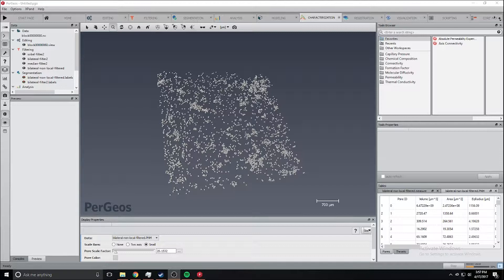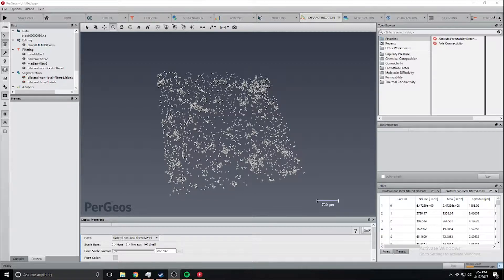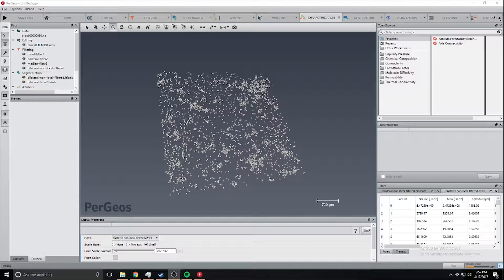Some of the problems with this MicroCT dataset is it's too big, it has some noise, so we're going to need to apply some filters to take out that noise, and then we're going to actually do the porosity analysis.